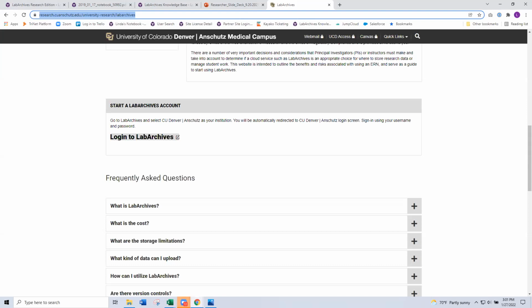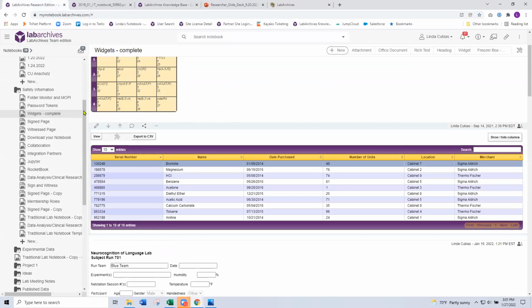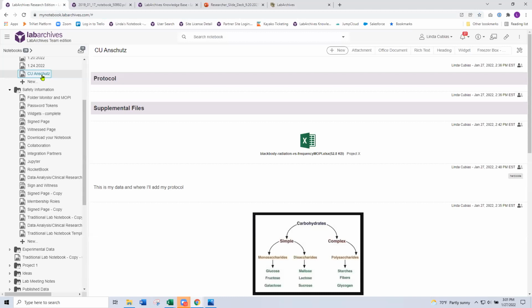Okay, I'm still filtering through the questions. Somebody's asked about coding languages in LabArchives, great question. So we've got a few different entries that might be suitable for that as well. We have a lot of researchers that do use and store coding here, but it's really to store the code itself rather than run the code through LabArchives.